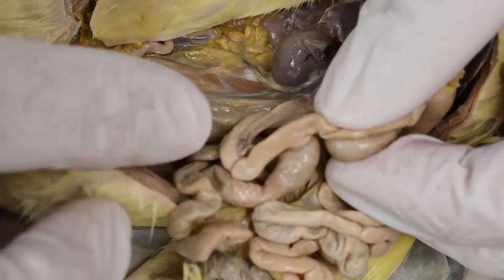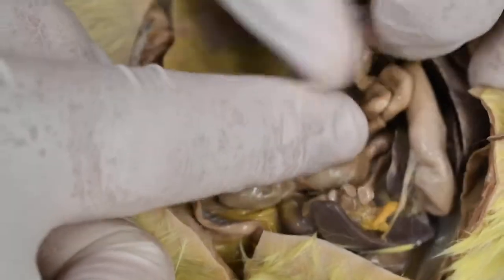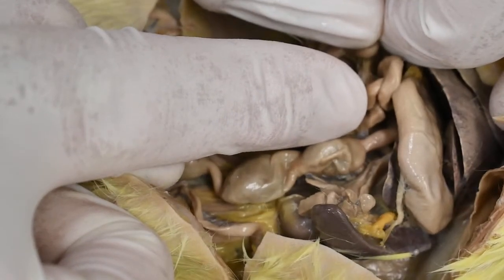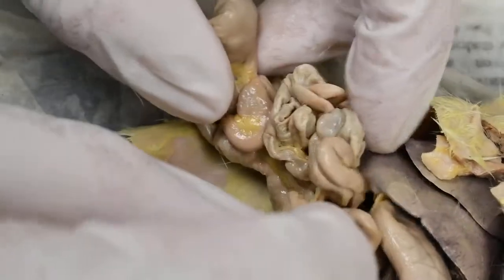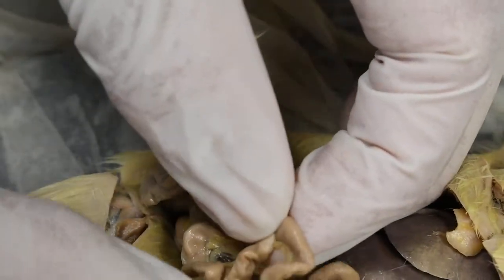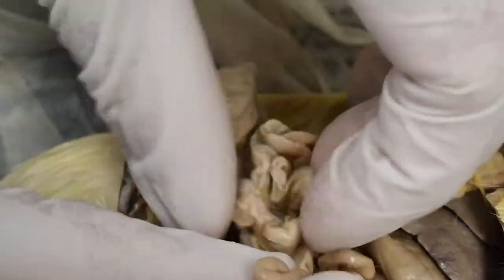That's still duodenum. You follow it up again, and then we start to lose it. But maybe you can sort of see here, the duodenum is coming up, and then it turns again. That's the end of the duodenum where it makes that turn. The next section is referred to as the jejunum. Now, at some point, the jejunum becomes an ileum, but we can't really tell where that occurs without making cross sections through the intestine and looking at the height of the intestinal mucosa. So that has to be determined with microscopy rather than with gross anatomy.